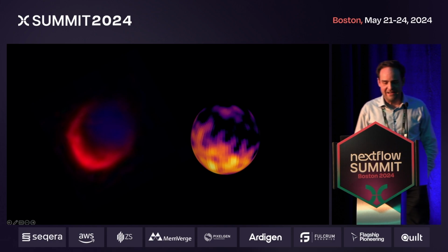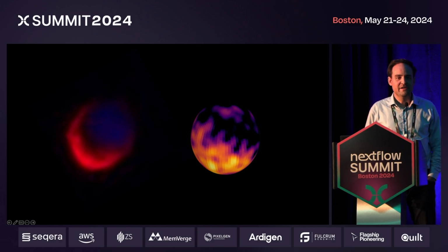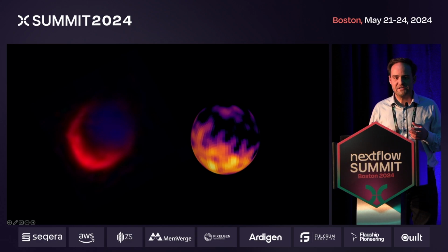Right, let's dig in. So this is a cell, and in the left picture, you can see a cell in a normal confocal microscope. On the right, you can see the reconstruction that we have done of the MPX cell information to an idealized spheric projection. The cell, both cells, they are different. They have been treated with the same biological drug.